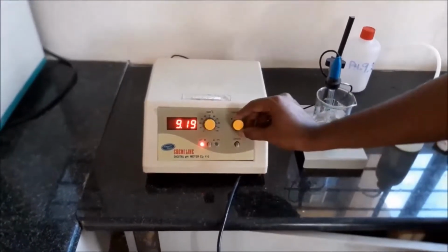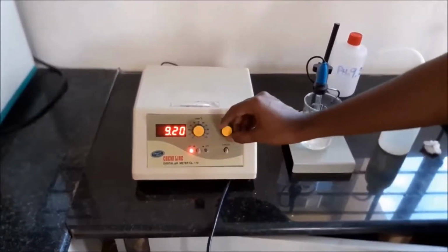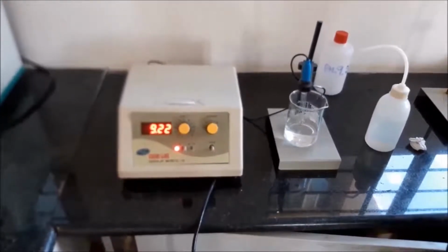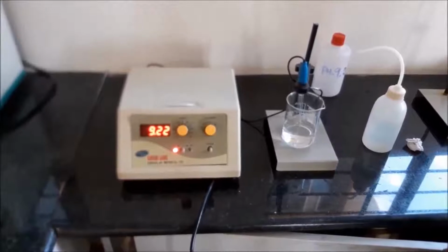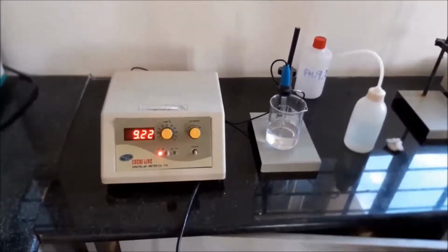You can adjust the knob and wait for a couple of seconds so that the pH value is calibrated to value equal to 9.2. So this completes the calibration part.